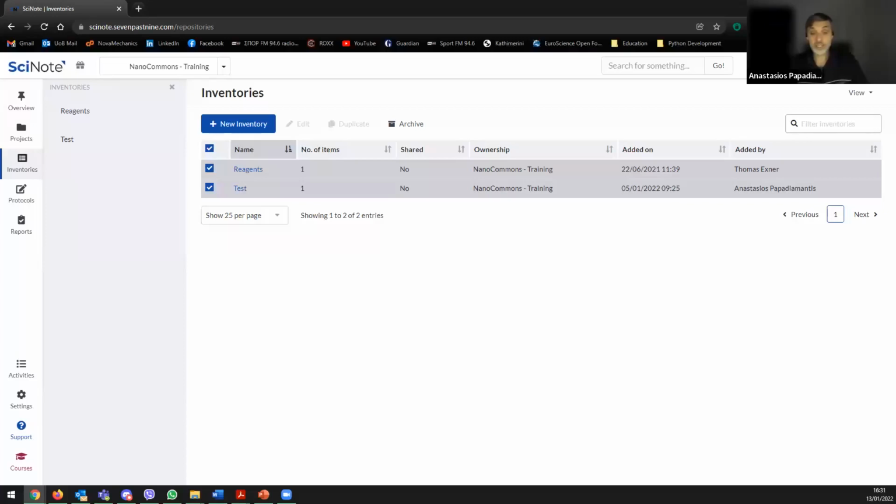About data privacy now, it's the same thing. As I said, with the electronic laboratory notebook, the philosophy is that you work with other people and you share things with the people you're supposed to share with. If you're not part of the team, the project, or the experiment or task, you're not able to access or see the data. This is why there's this assignment process, so that everyone can see what they are entitled to see.